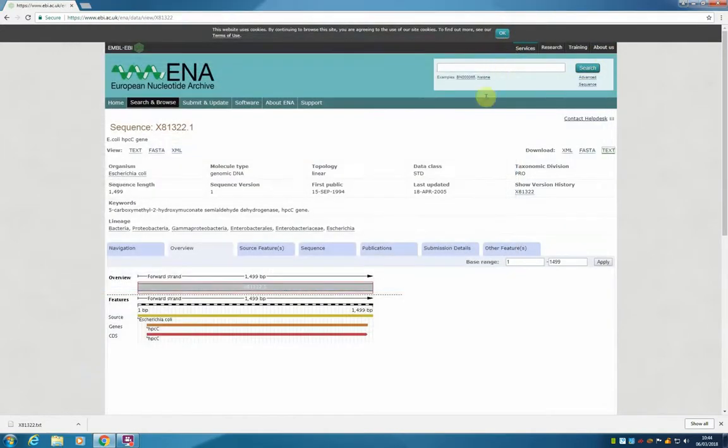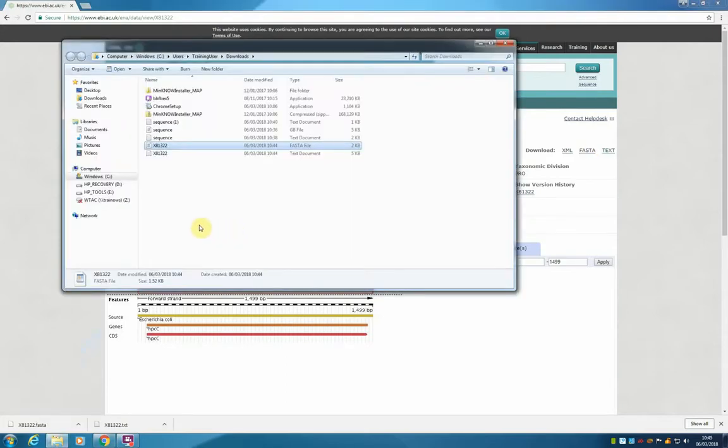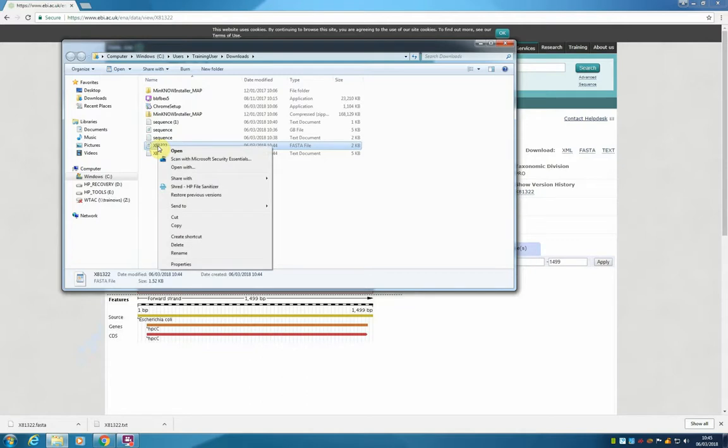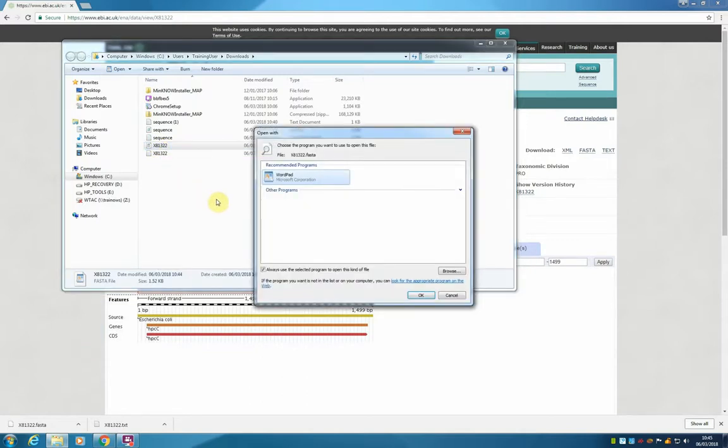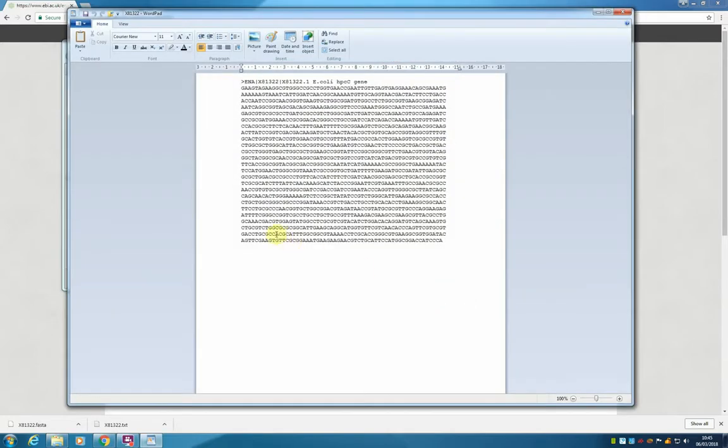If we wanted to just download the FASTA sequence, we can use the link FASTA at the end. We can repeat the same procedure. But now the extension might present some problems. So we are going to have to choose to open it with WordPad. And here's our sequence.